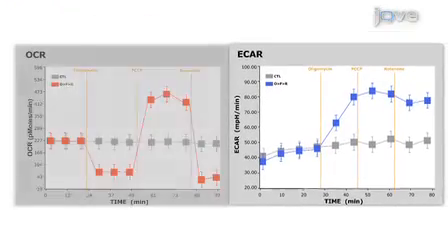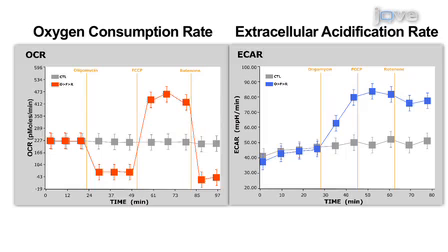Mitochondrial profiling results can be obtained that provide insight into the central role that mitochondrial function plays in determining the lifespan of cells.